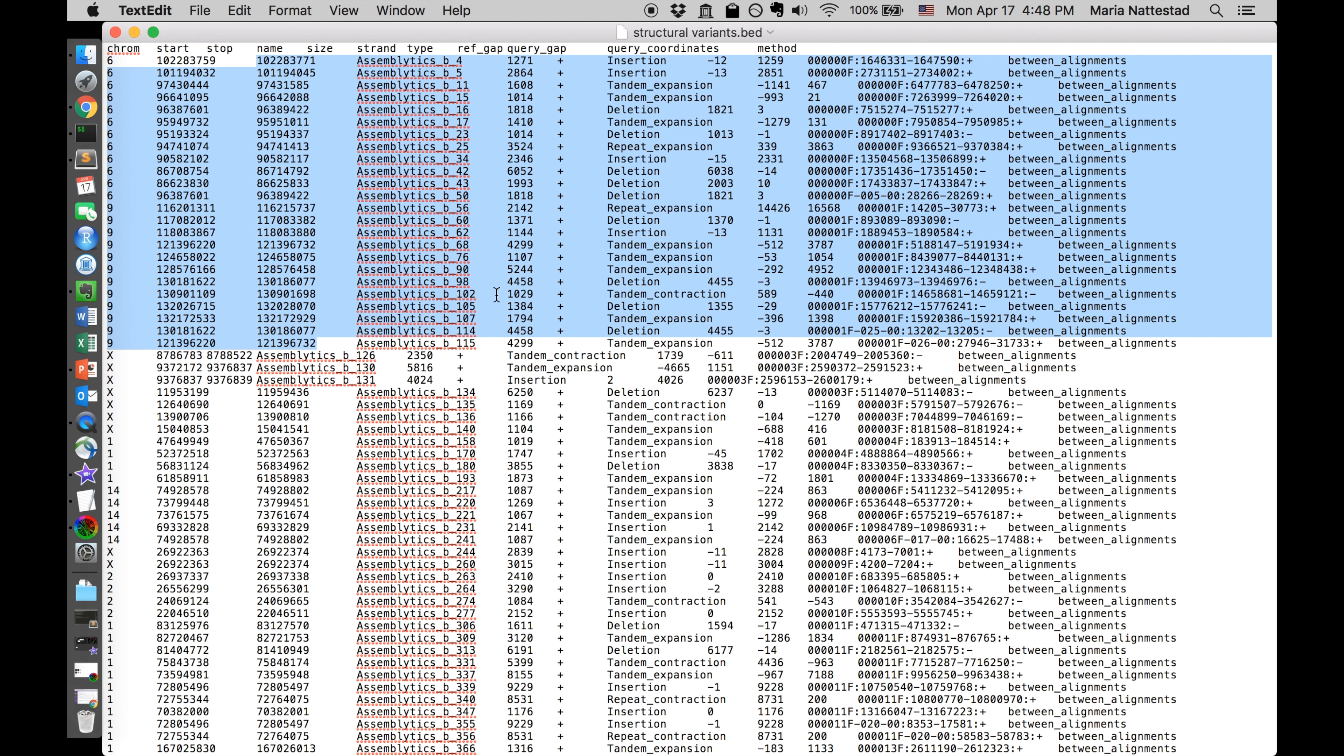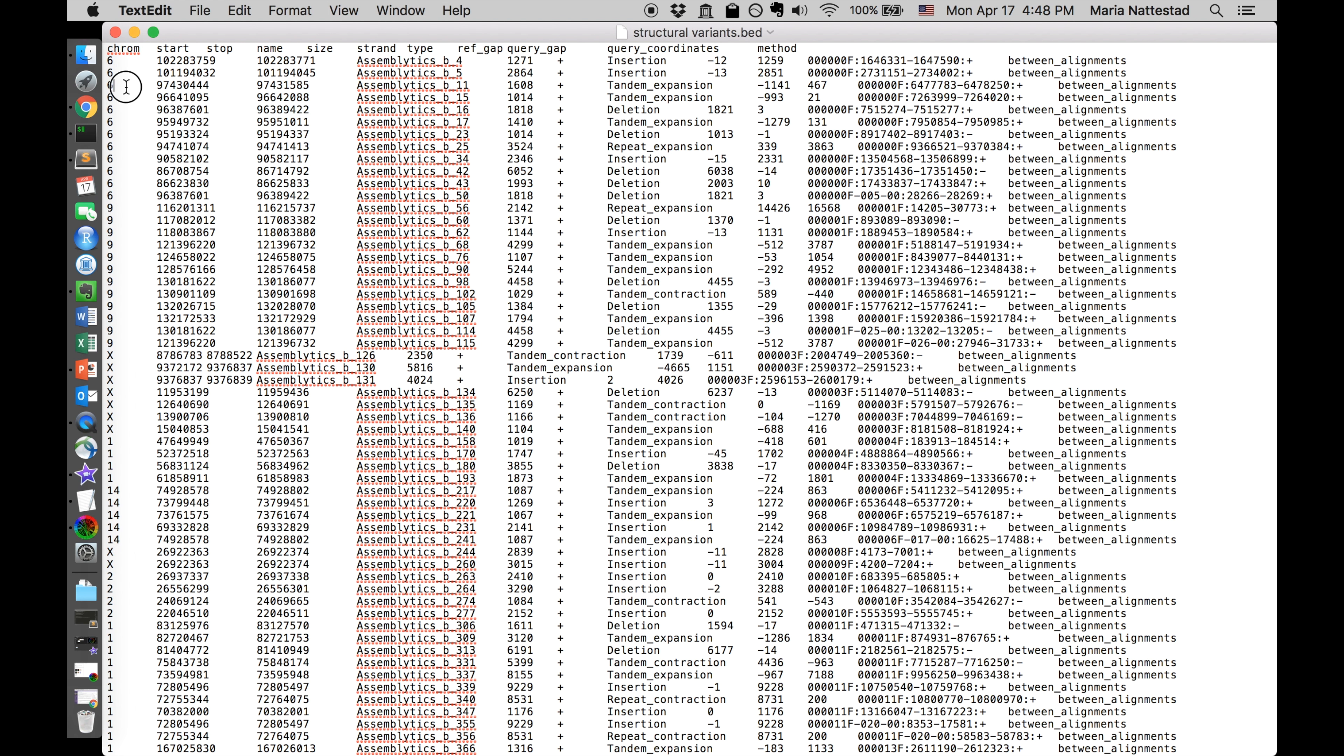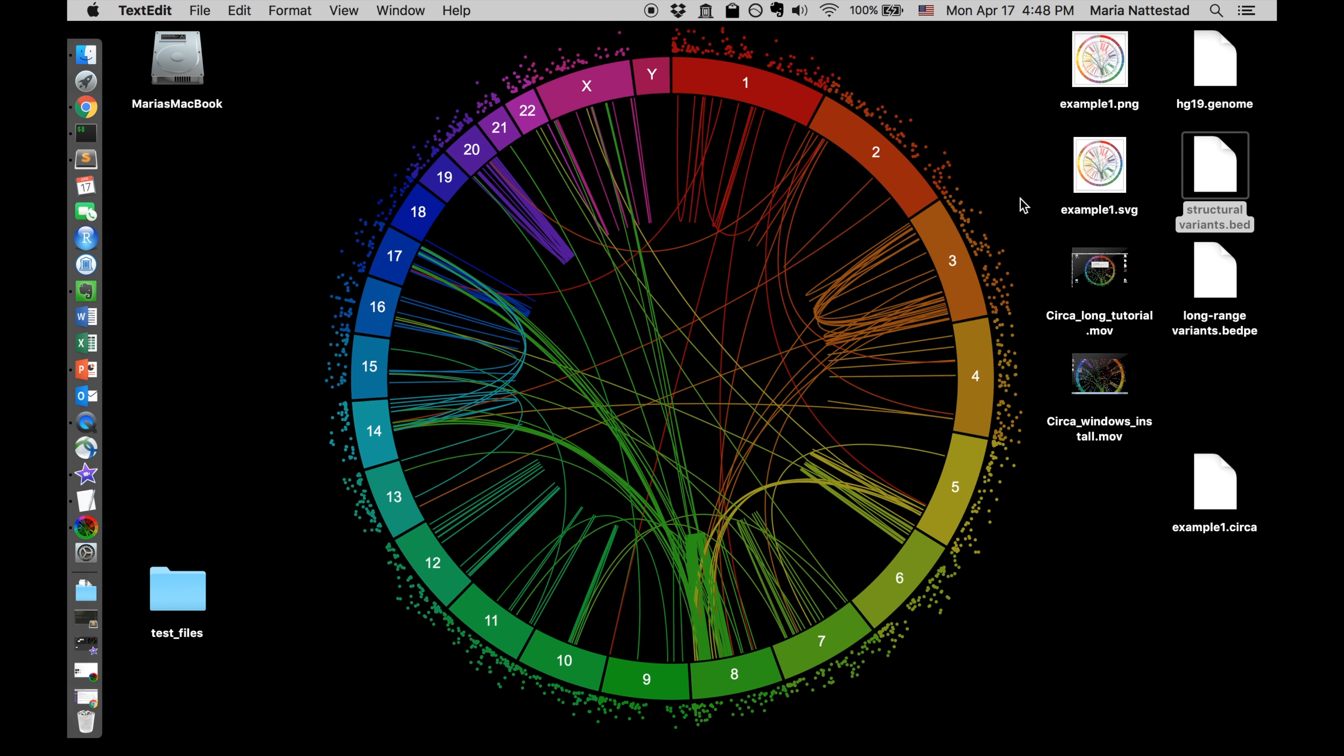If you're doing connections you're going to want something that has two chromosome and position positions. So this is a bed file and it's just like a tab separated file. It could also be comma separated.